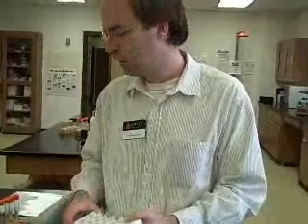Could the yeast digest these sugars, or could they not? Organisms that can't digest those sugars can't digest them because they're lacking the correct enzymes. You can imagine if you went out in the woods and picked up a stick and started eating it, you wouldn't be able to get energy from it because you're lacking the correct enzymes to digest that cellulose. But something like a termite could, because it does have the correct enzymes in the bacteria in its gut.